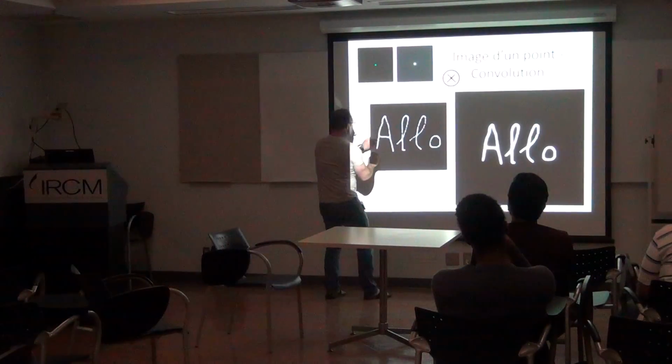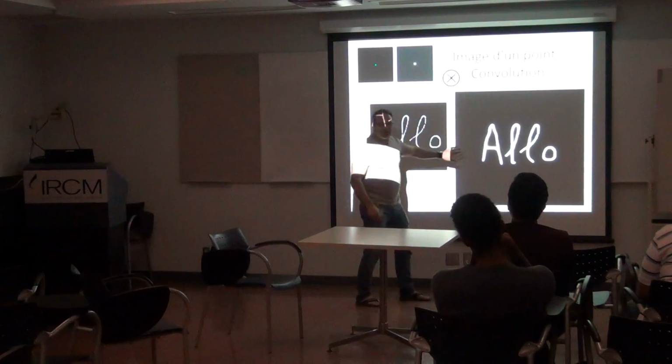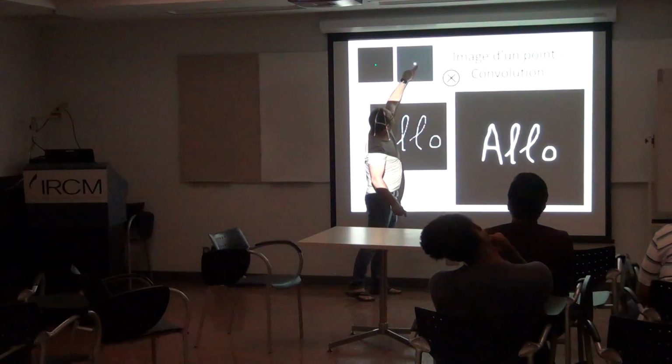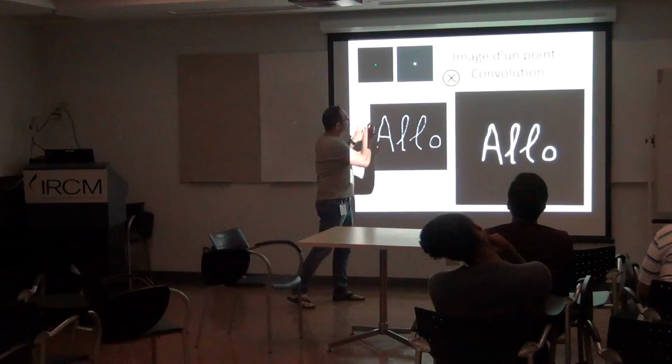It gives this, and you're going to add all those functions, and you turn out with an image like this, which has kind of a shadow surrounding it, because for every pixel it produces a ring of shadow like this. Okay? So that is the convolution.